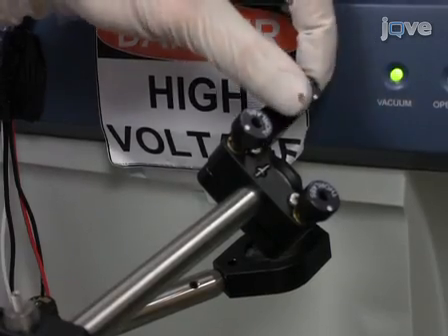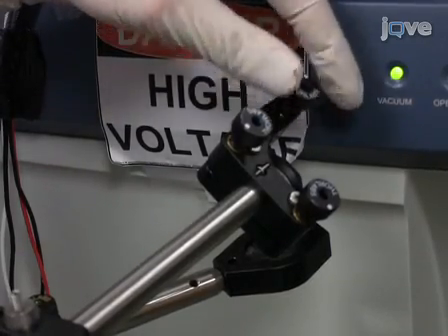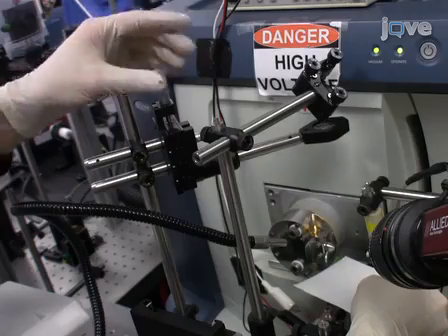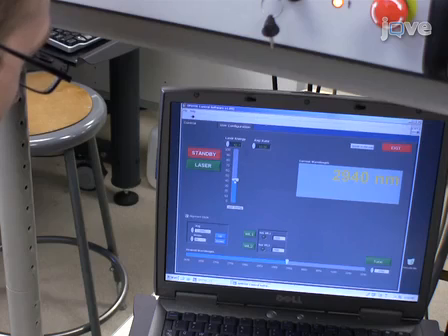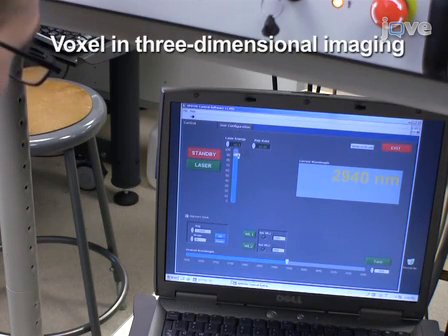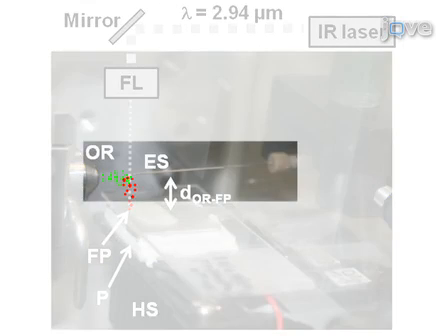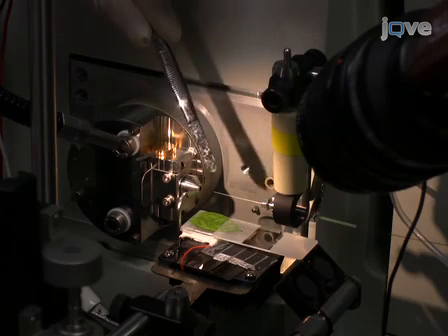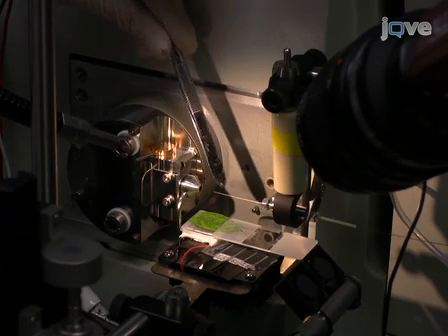Position the mid-infrared beam axis 5 to 8 mm in front of the orifice of the mass spectrometer sampling cone. Adjust the focusing lens position and the laser pulse energy to achieve tissue removal in the focal spot to the desired depth. The dimensions of the ablated volume determine the pixel size for the imaging application. Position a nanospray emitter in line with the inlet axis of the mass spectrometer and at an orifice to emitter tip distance of around 10 mm.